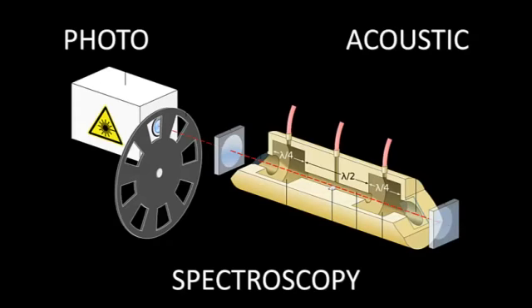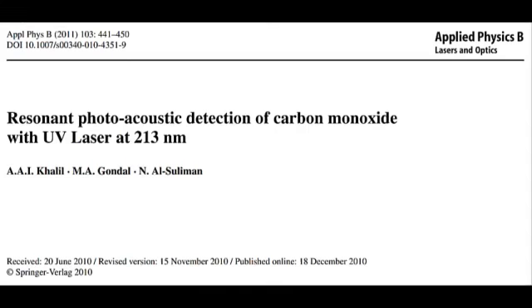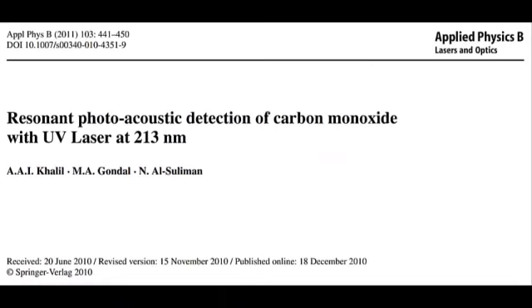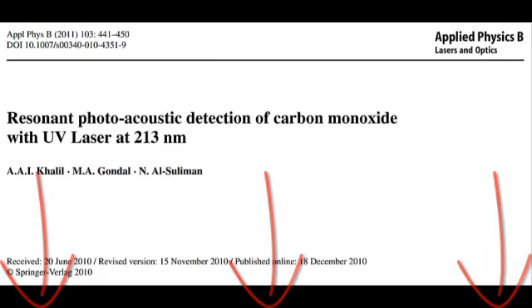If you would like to learn more about photoacoustic spectroscopy, I recommend reading Resonant Photoacoustic Detection of Carbon Monoxide with UV Laser at 213 nanometers, which is a research article composed by A.A.I. Khalil, M.A. Gondal, and N. Al-Suleiman. You can find the citation of their article for better searching in the comments below the video.